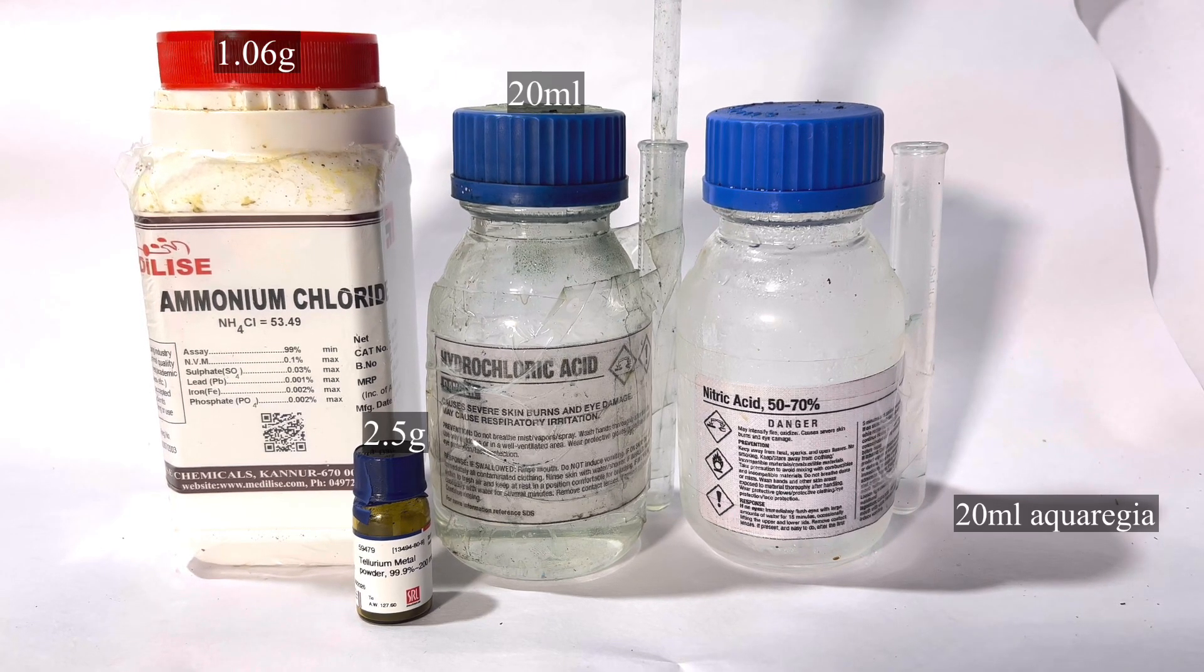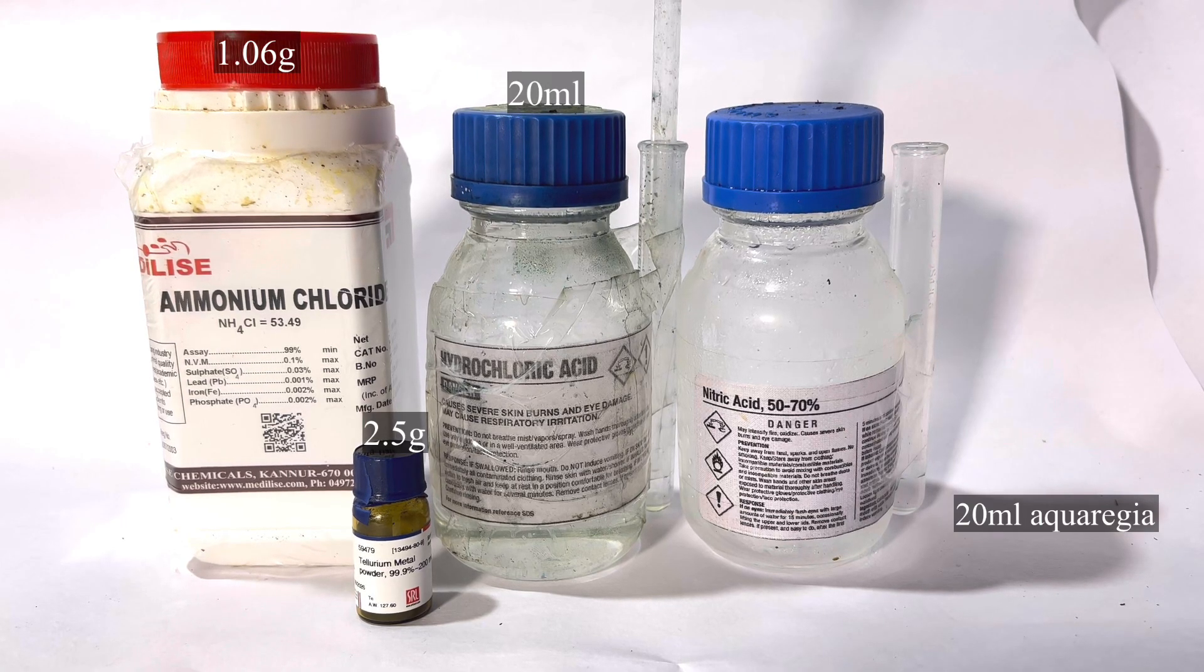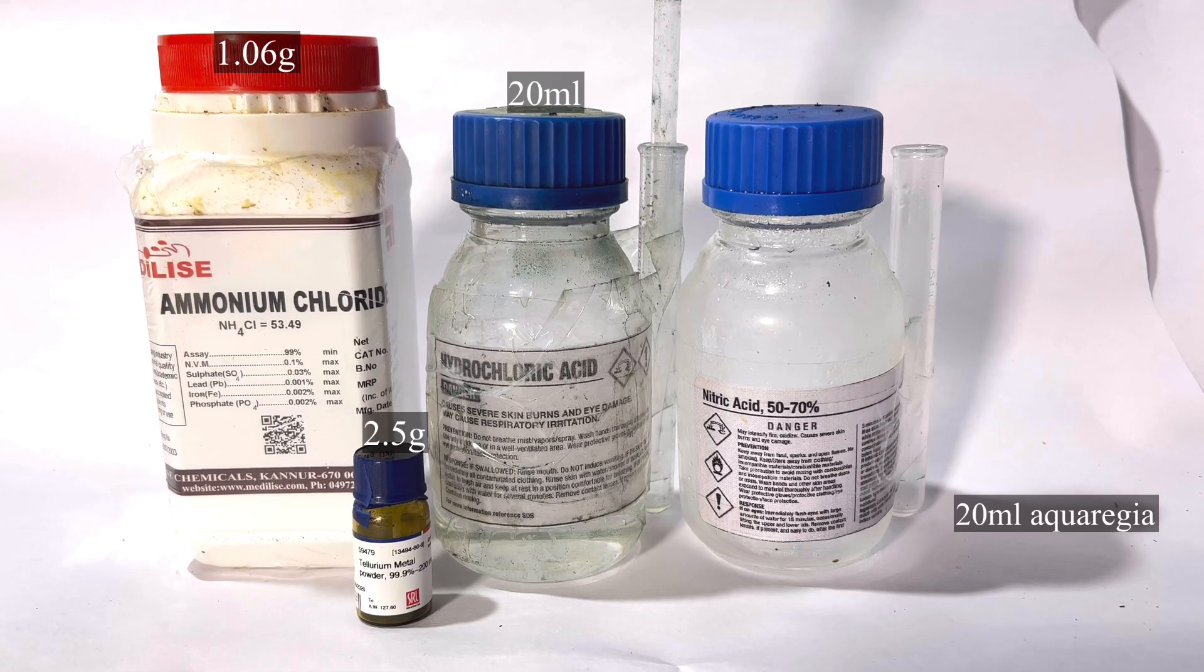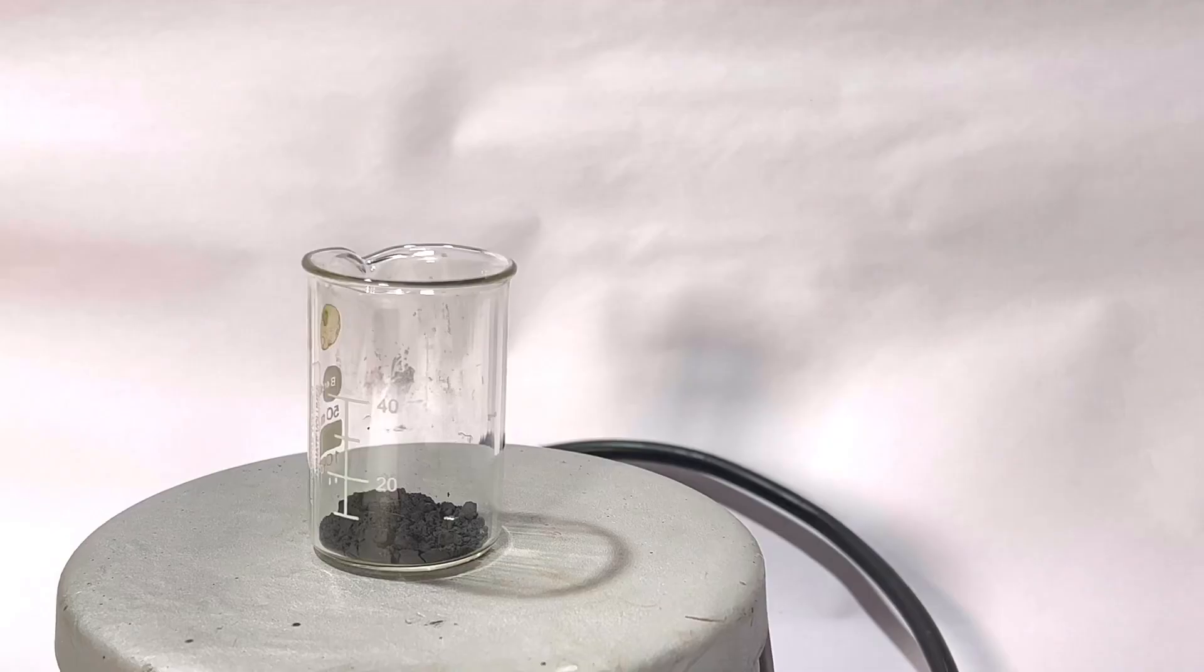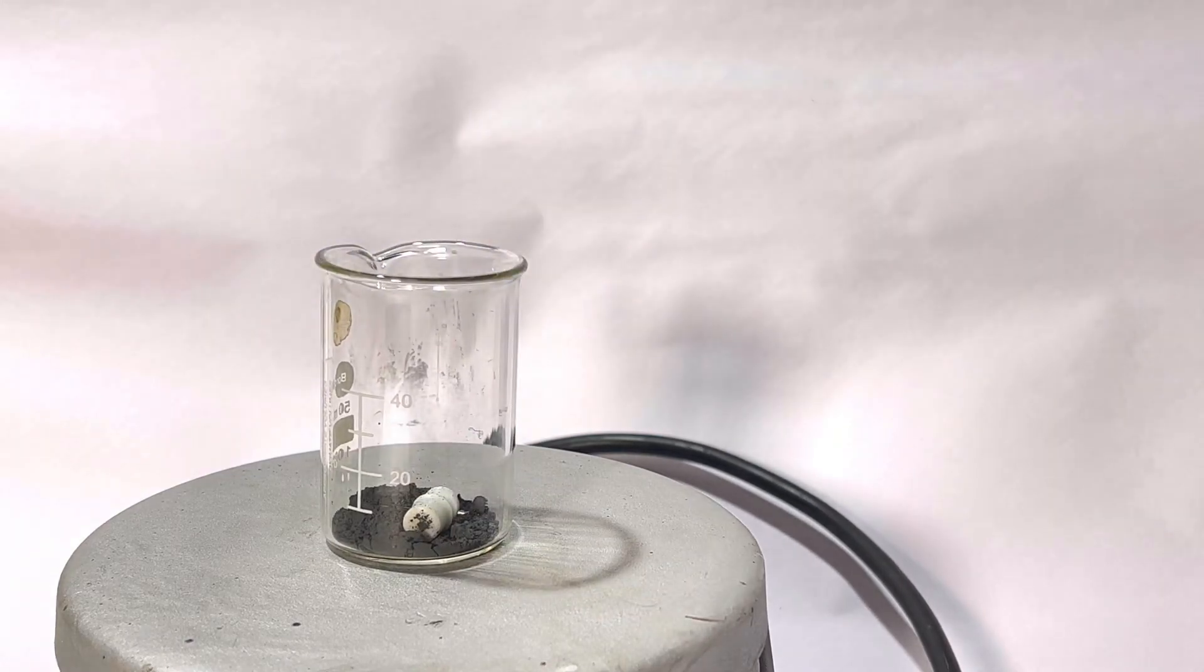To result in a clear solution, I used around 20 milliliters of concentrated 35% hydrochloric acid and 1.06 grams of ammonium chloride. Start by taking 1.5 grams of tellurium metal powder in a beaker with a stirring bar inside.